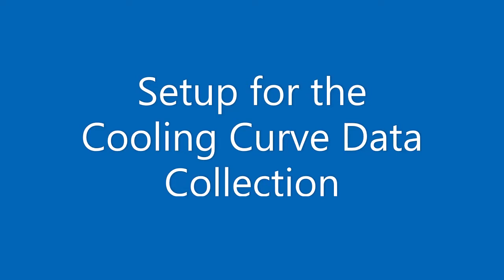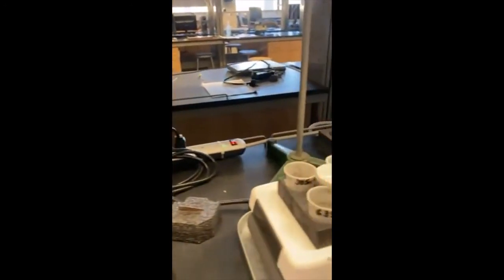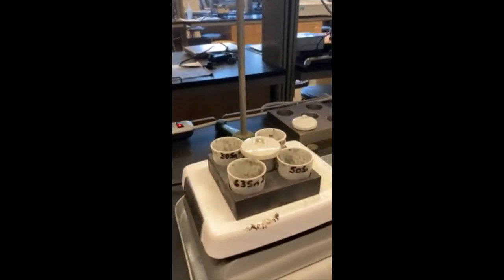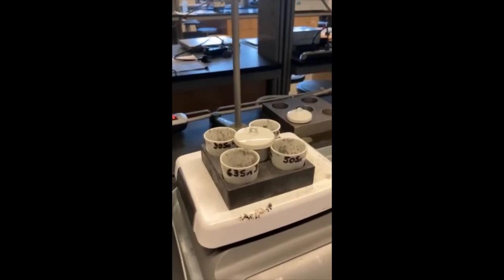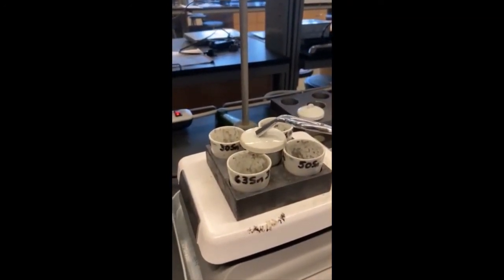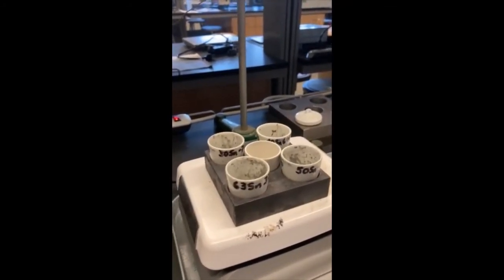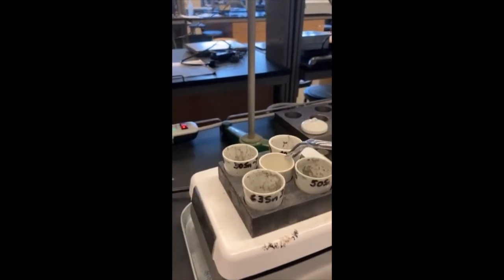Let's explain how the first part of the experiment is carried out and what data will be collected. To begin the cooling curve analysis, we have a software program that will record the temperature of the thermocouple that will be immersed in the crucibles of the liquid alloys and record the temperature as a function of time to produce the temperature versus time cooling curves.